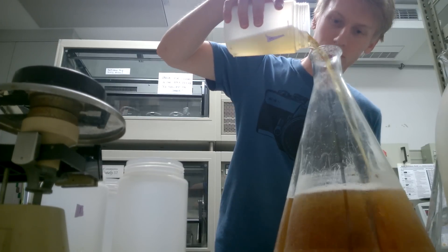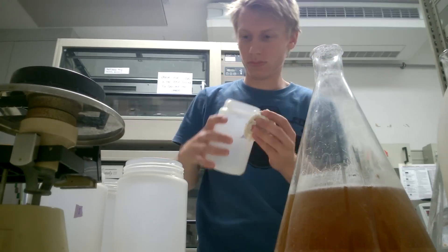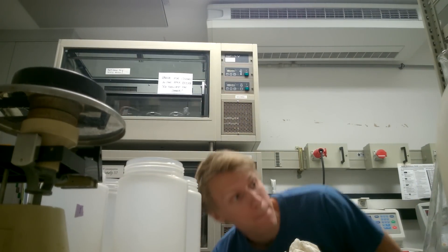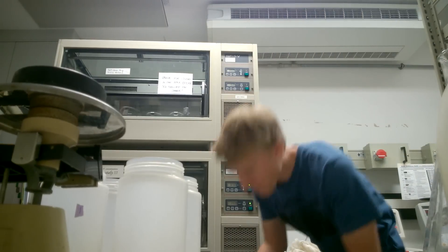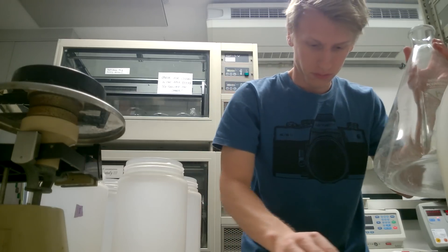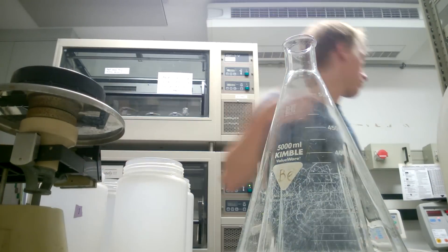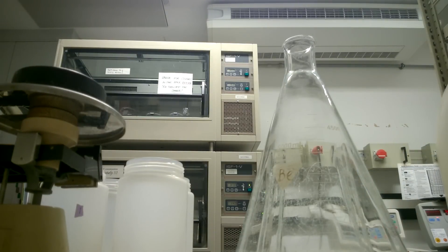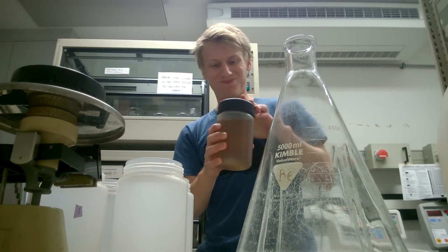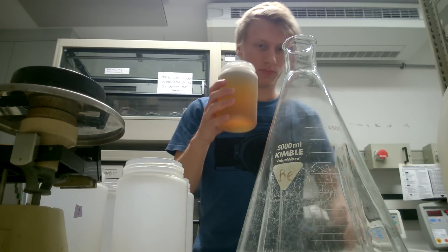There are six of these cups in one centrifuge rotor and each can hold a little bit above 900 milliliters. This was full now, so I got an empty one to fill up. There's only one flask left with actual culture in it — this is the third run of the centrifuge already. It's always the same thing, so nothing too fancy.